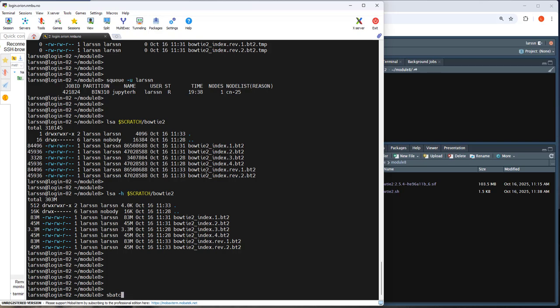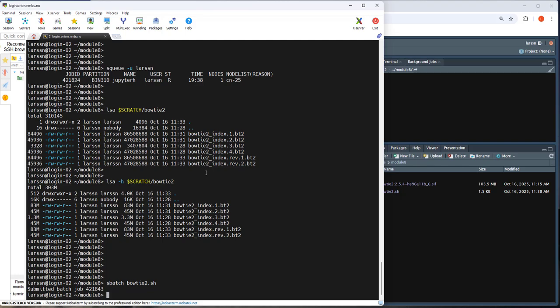Actually, we can just use the up arrow. Why don't we use that? The up arrow, we can just click up, up, up, until we see the old command that we want to run again. And now it's running again.